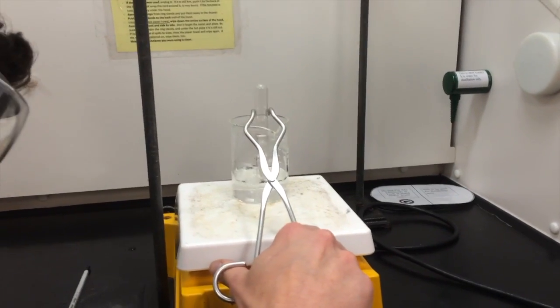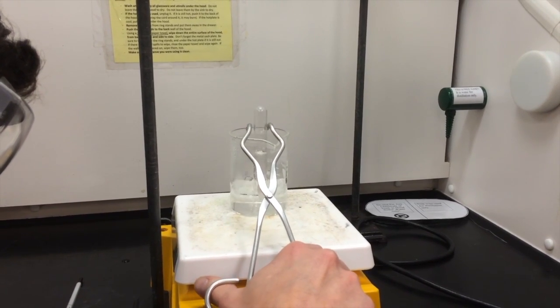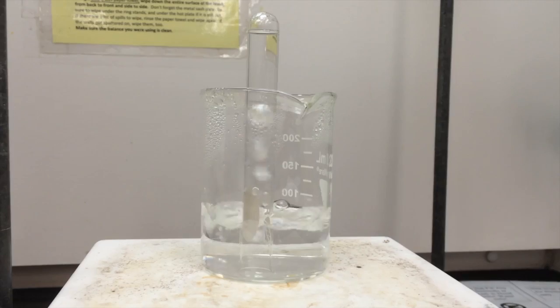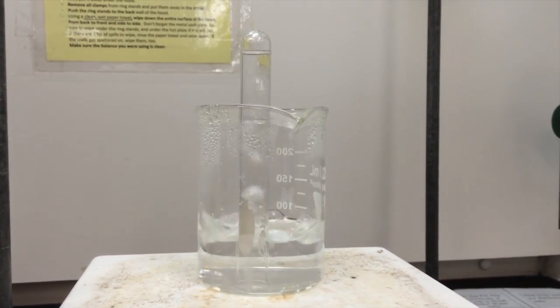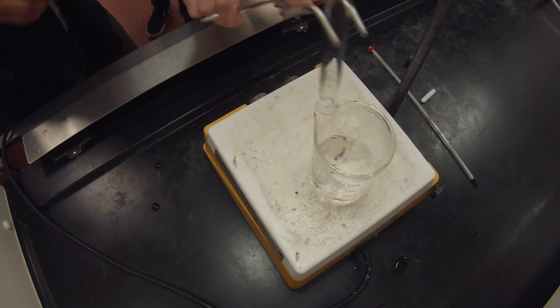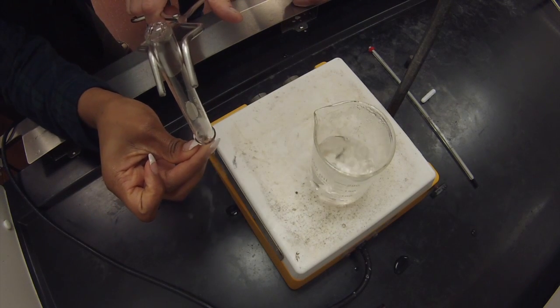We now want to start trapping some of the bubbles in the test tube. This might take some coaxing, but lifting and moving the test tube seems to work pretty well. You should see something like this. Once the tube is filled with gas, quickly remove it from the water and insert a lighted match inside the mouth of the test tube.